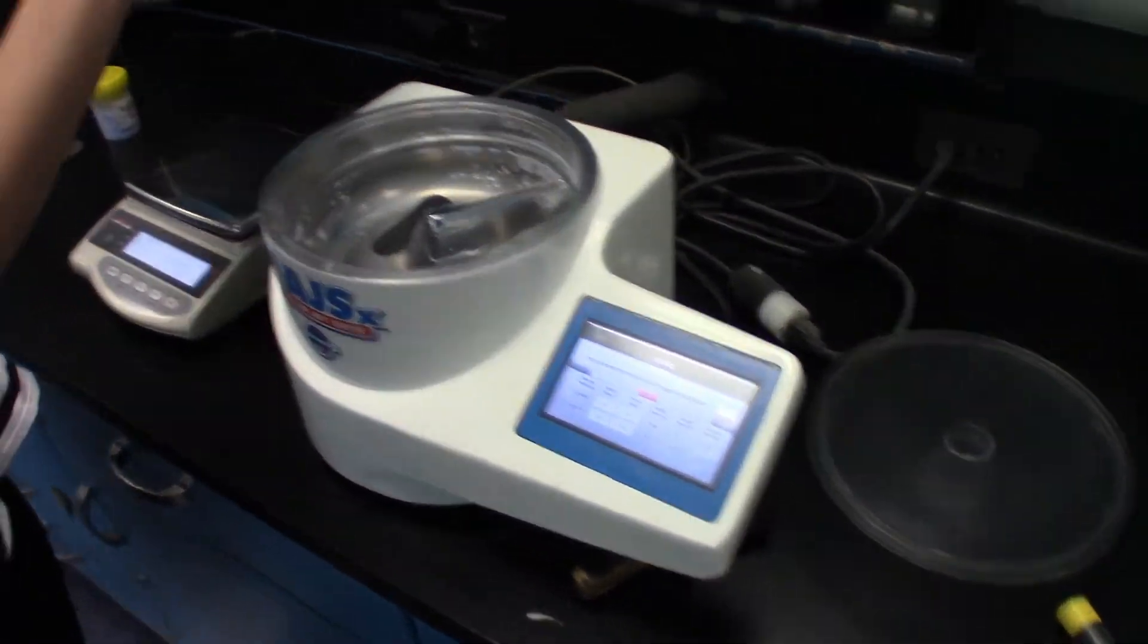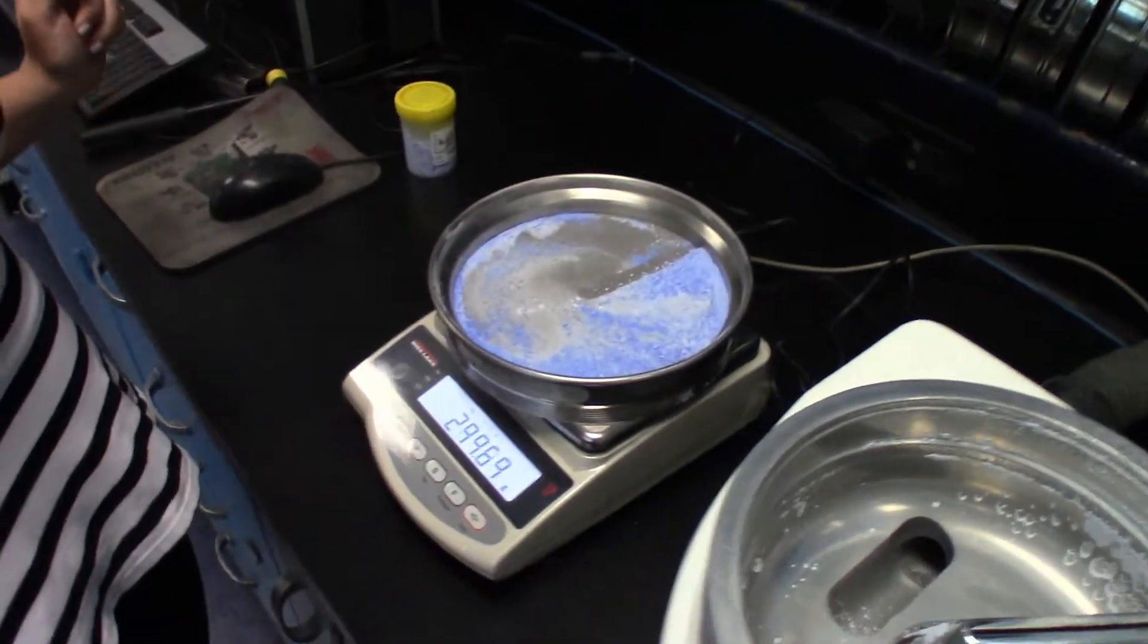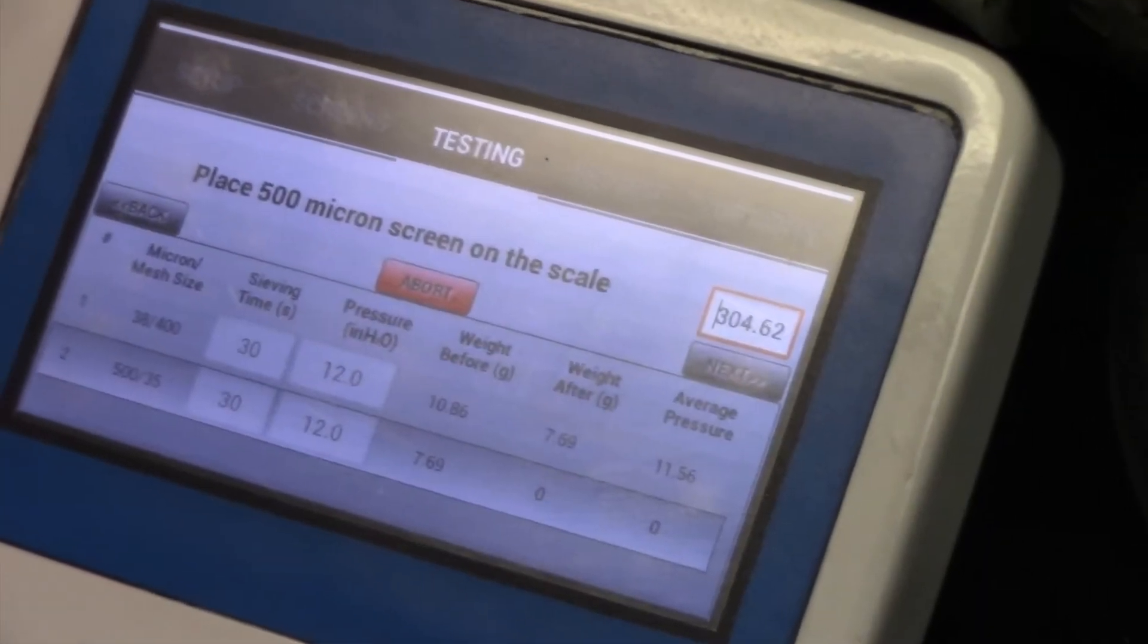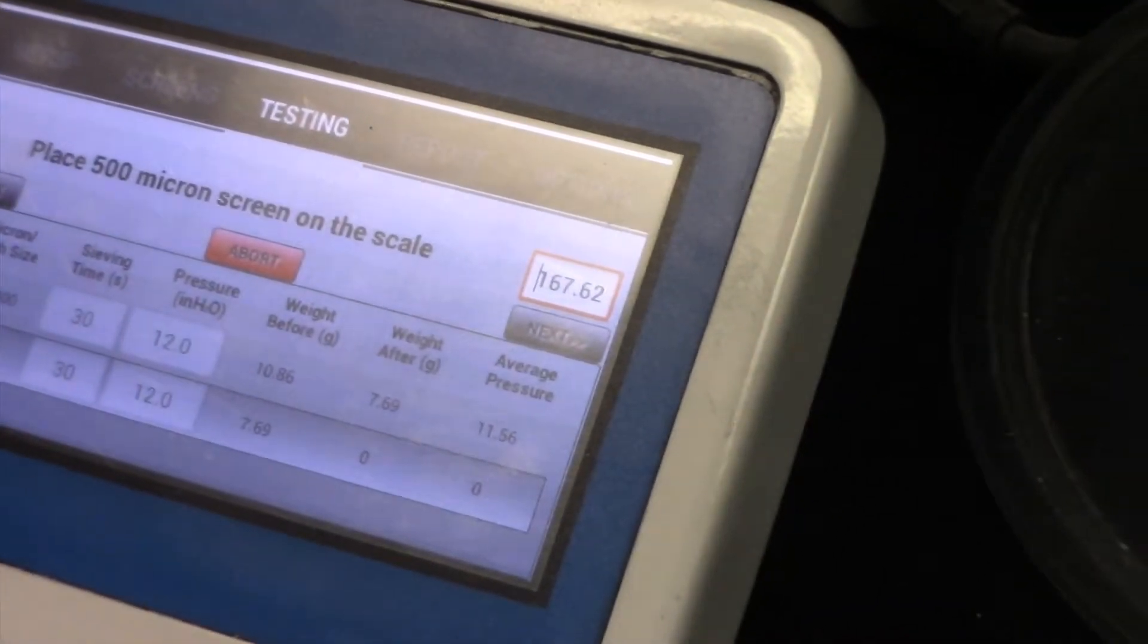With the retained sample, we're going to weigh it. Next. We're going to place this one off to the side. I'm just going to place it on the sieve for now.